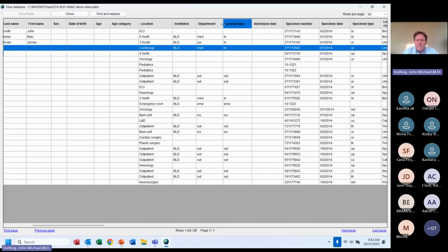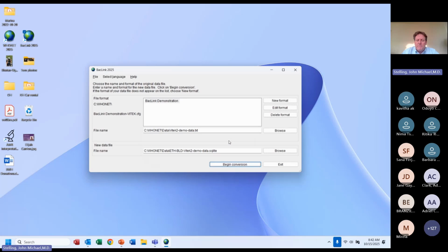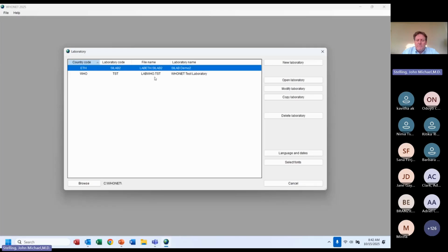I'm going to click on here, close. Do you want to review the new codes? No, I've already done that. Okay, good. All right. I'm going to leave BacLink, and now how do I get started with WHONET? I go to WHONET, start WHONET, and my Vitek is not here on the screen.